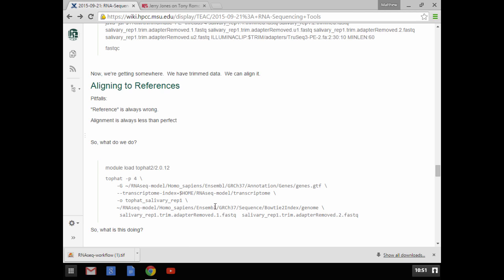All it needs is the location of the alignment and the actual names of the genes in the genome. So to do that, you would use a much more simple aligner. BWA or Bowtie would be the tools, you've probably seen them before, that you would use instead. And then instead of all of this, it's just Bowtie 2, reference genome, output file, reads.